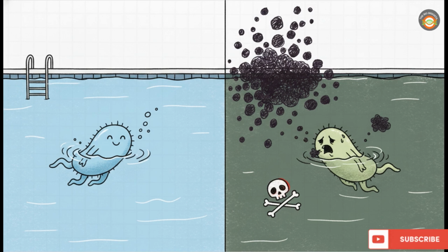Think of it kind of like maintaining the pH of a massive swimming pool. If you aren't constantly monitoring and adjusting the chemicals, the water quickly turns cloudy, green, and completely unsafe. Well, in a fermenter, the stakes are literally a matter of life and death for the yield. If the pH drops too low, those microbes will acidify themselves to death, and production just grinds to a halt. So constant monitoring is absolutely vital here.